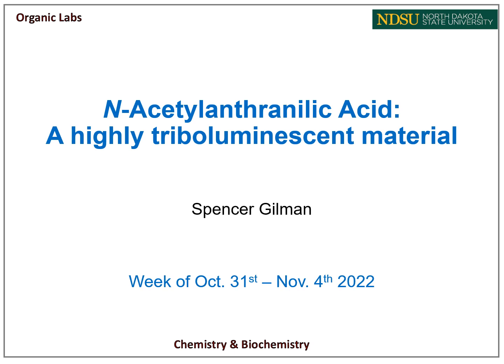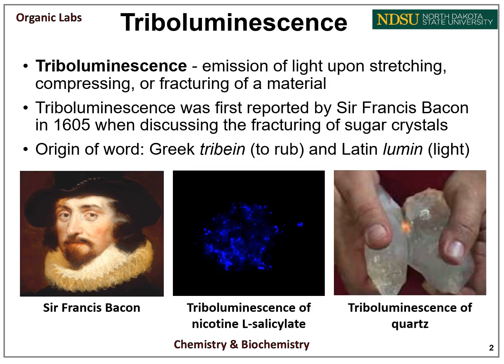In this week's lab, we will synthesize N-acetylanthranilic acid from anthranilic acid, acetic anhydride, and water. Once synthesized, we will observe the triboluminescent properties of N-acetylanthranilic acid. Triboluminescence is the emission of light from a material upon stretching, compressing, or fracturing of the material.